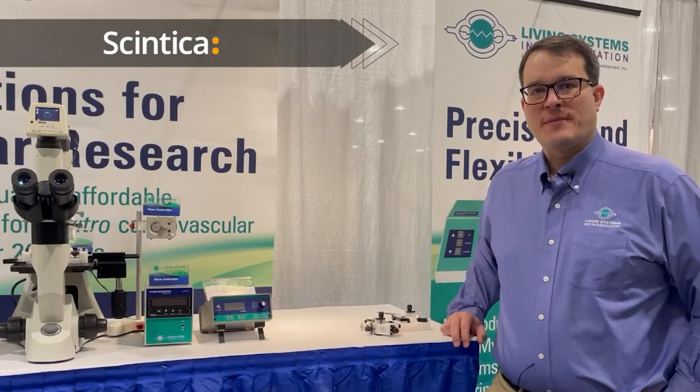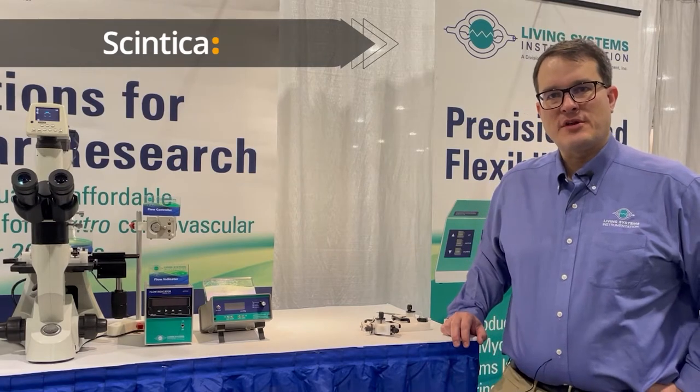Hello, my name is Jerry Herrera. I'm the president of Living Systems Instrumentation and today we're going to be looking at some of the features of our large vessel chamber.